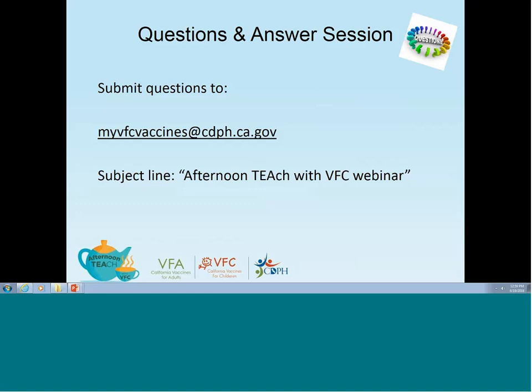Yeah, I think our strong encouragement would be for you to maybe look at replacing that unit with a different unit, because that is really not allowing you to monitor and record and respond to temperatures accordingly. There are so many different variables that you're always going to be troubleshooting for. So that would be our recommendation for you.